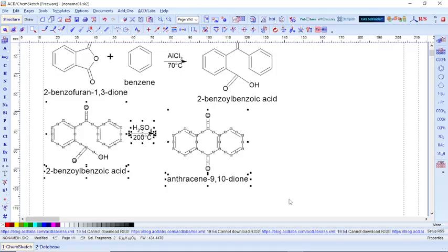The workflow is start from the bottom, assume an expected yield of your product, then from the last equation, what quantity of the intermediate will produce that expected mass of the product, then from the intermediate again, what quantity of the reactant will give me the calculated mass of my intermediates, which will further lead to my final product.